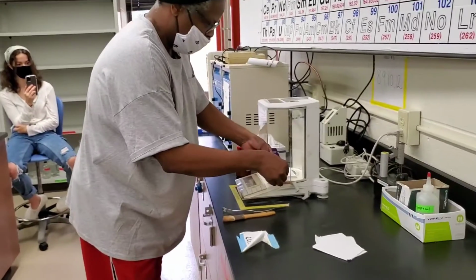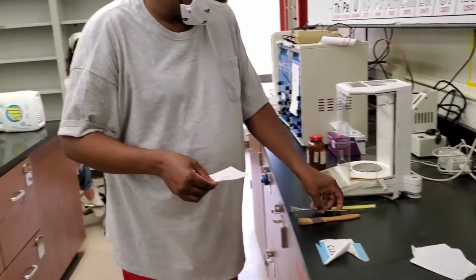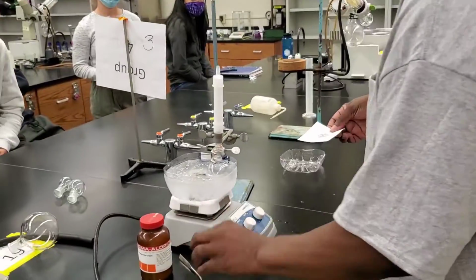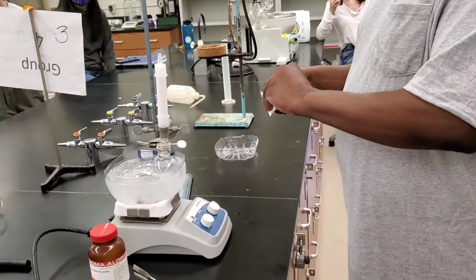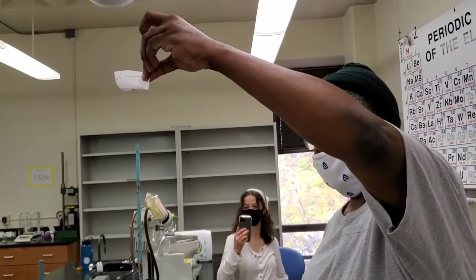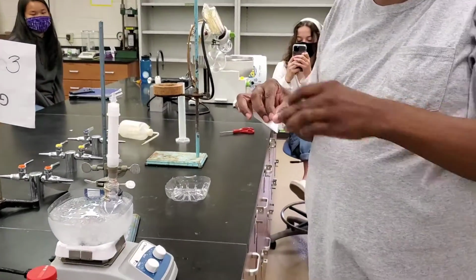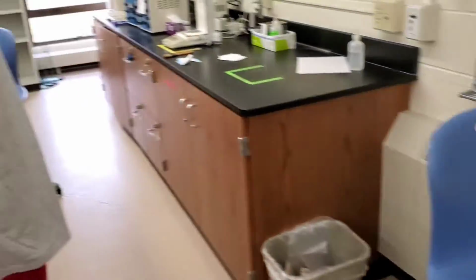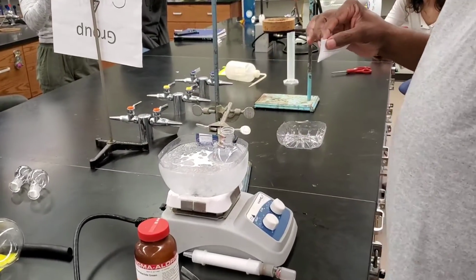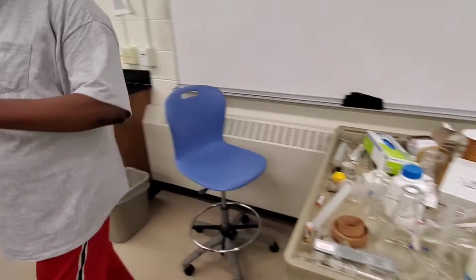So we take our product and we could do two things here. One is we could turn this into like a funnel, like so, and put it in. Or we could take an actual funnel, right? And remove this and put your stuff in. At first, I would probably suggest you guys using the funnel.